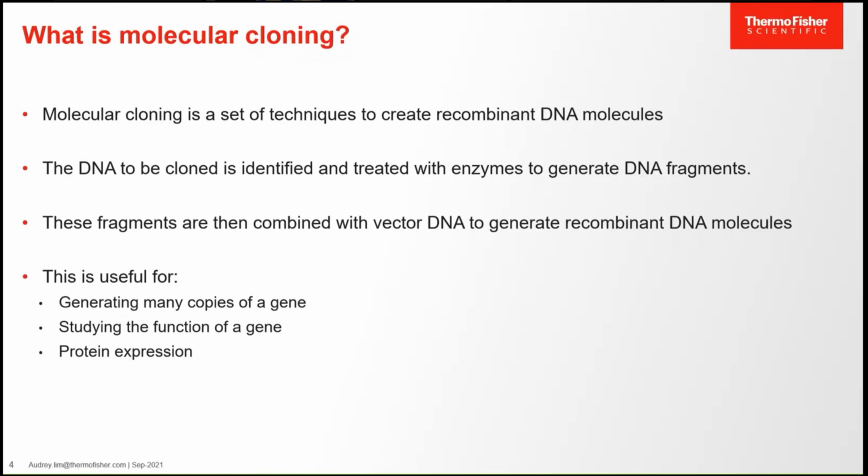Okay, so now you may ask me, why not just do a PCR? Just recall from our last episode on PCR, DNA polymerases are limited in their fidelity and also the length of DNA that they can amplify. With molecular cloning, the replication of the DNA sequence is almost always accurate, and you can copy even a very long sequence.